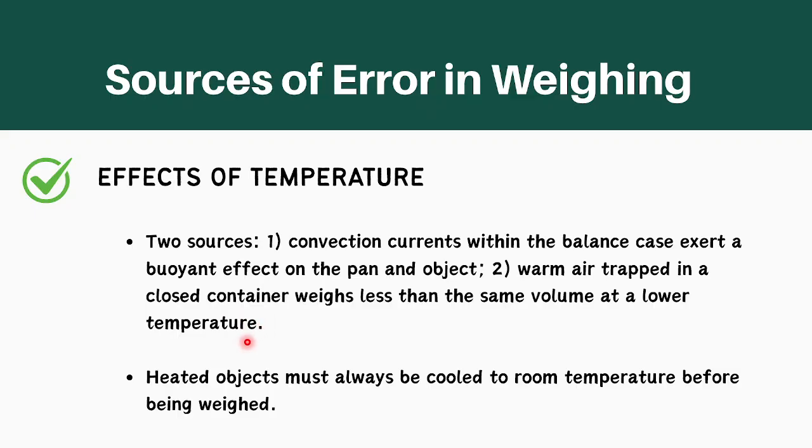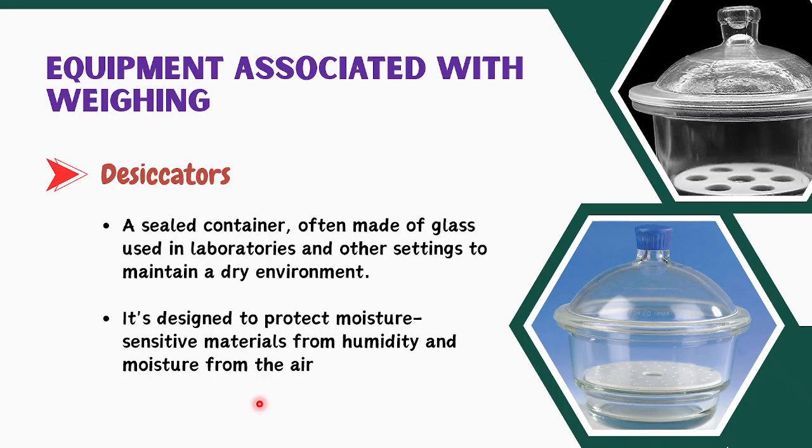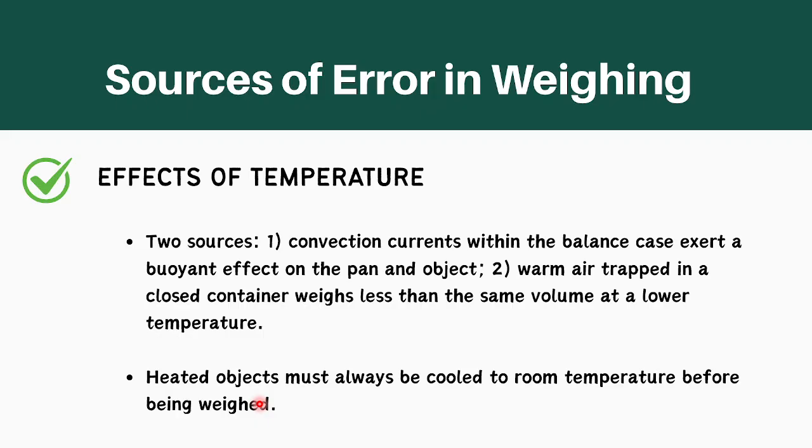Which is why if ever naa tayo mga gipang-init nga objects later on, before nato sila timbangon, they must always be cooled. Dapat pabugnawon siya up until room temperature before being weighed. Okay, so that ends our discussion for the apparatus that are commonly used in determining the mass of a particular object.